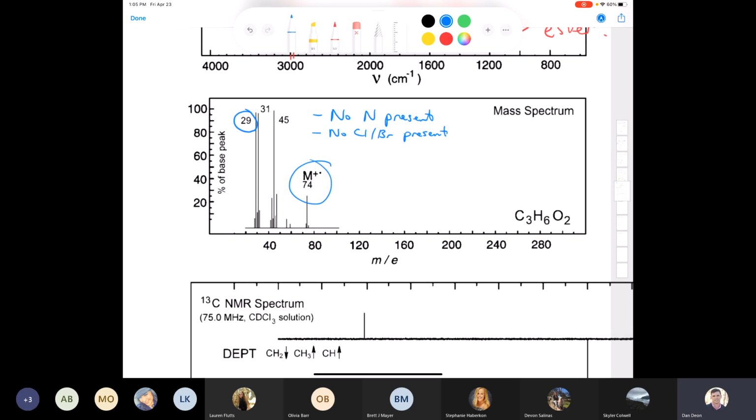Oh, what did you put, Lillian? Cha, perfect. Yes, 29 is probably an ethyl, right? An ethyl cation. Yes, yes. So we might have an ethyl group in here.